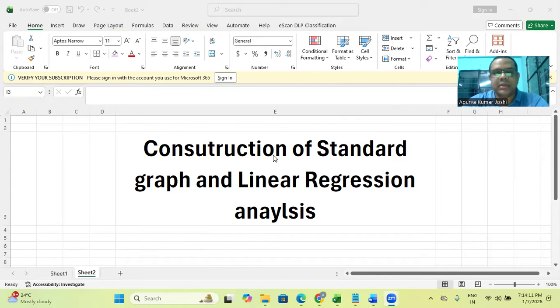And in this regard, often when a sample is analyzed for quantitative analysis, parallelly a standard is also constructed. And I hope this video will be useful for those who are trying to learn how to construct a standard curve and analyze the data by linear regression. Please keep in mind that linear regression is not the only way a standard curve data is analyzed.